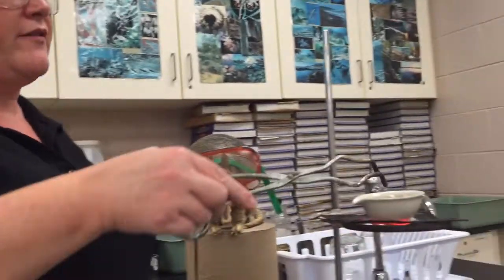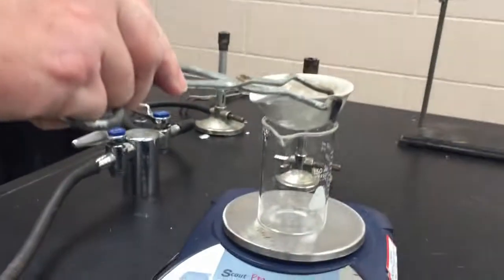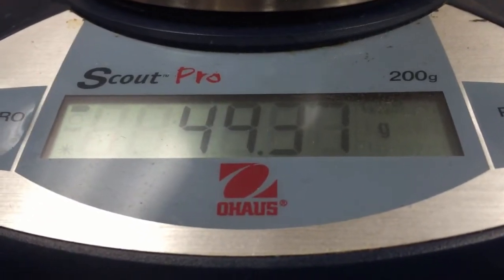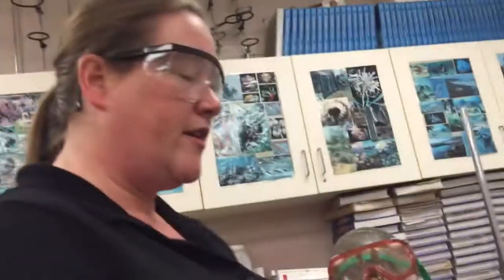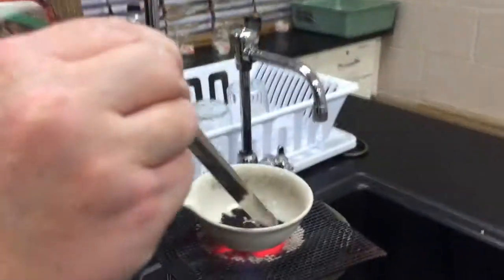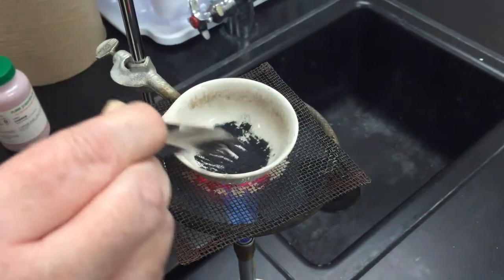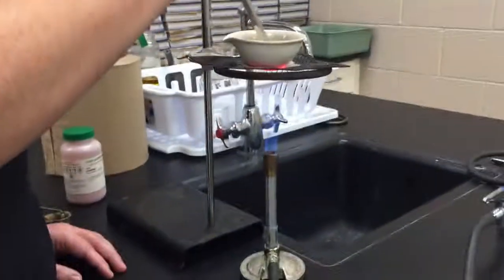So the mass before was 49.42, and I'm just going to get a current measurement. It's been heating for quite a while. It says 49.37, so it appears that the mass has gone down. I'm going to continue heating for a while and try to think of explanations that could make sense as to why the mass would go down. You see the contents of it are very black right now. And I'm still stirring so it doesn't stick to the bottom.